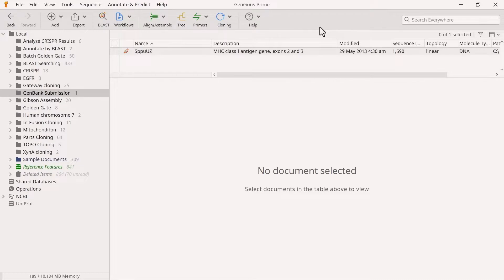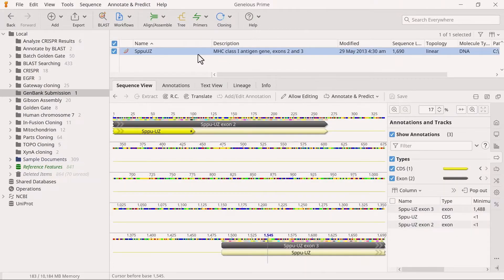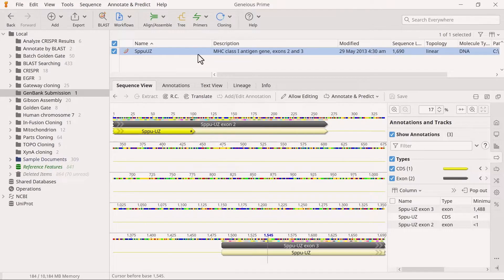In this example, we prepare a partial protein coding gene sequence for submission to the GenBank database.